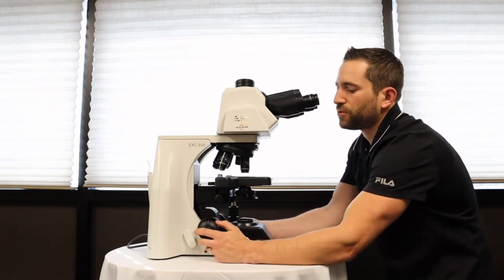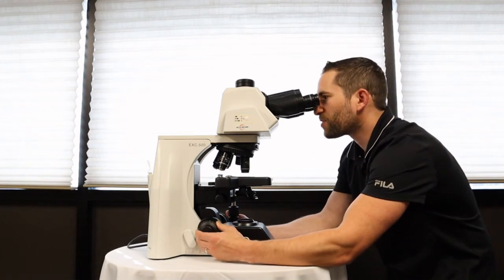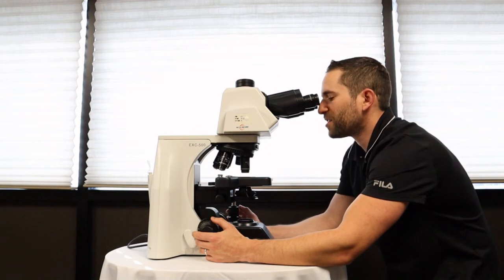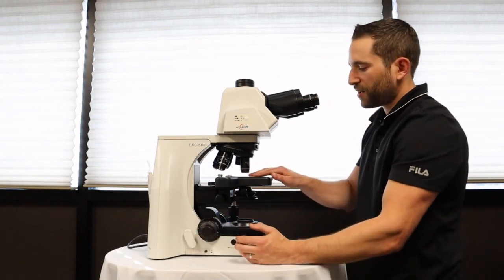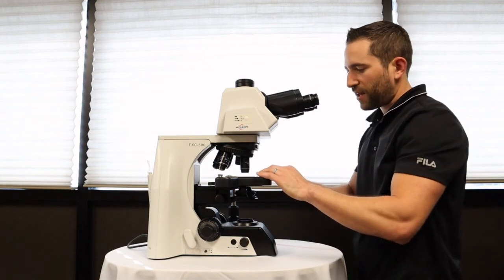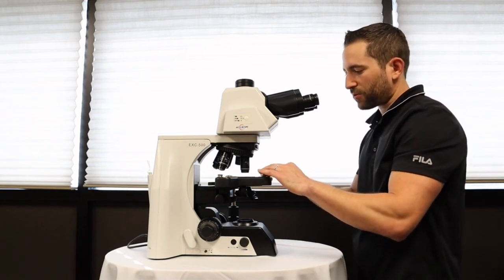You'll want easy-to-use coarse and fine focus knobs with large controls and a smooth mechanical x-y stage if you're going to use the stage by hand, or a very nice easy-to-move large stage should you want to freehand and remove the slide holder and mechanical stage.